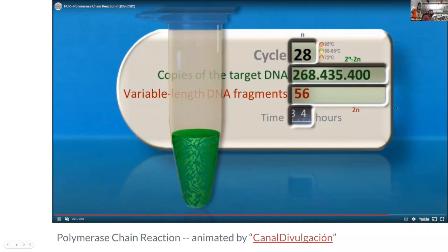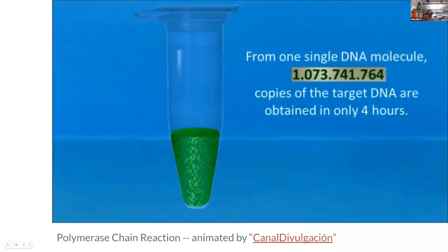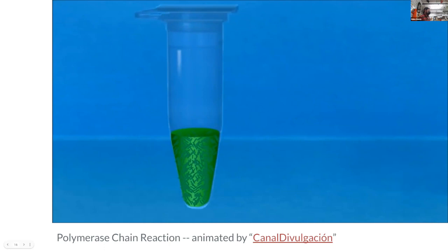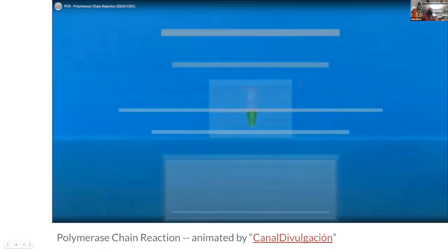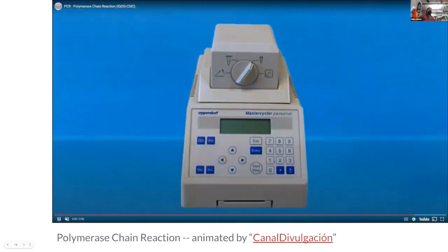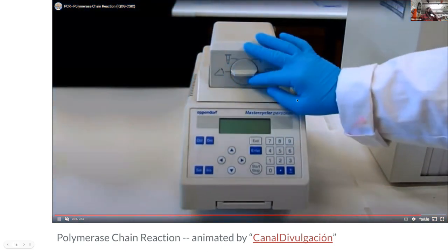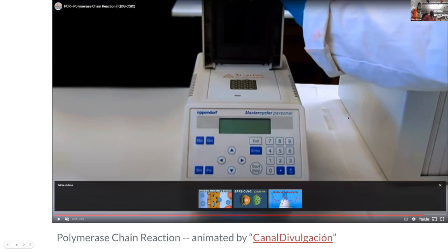So this is a process that we're going to start tonight, but we won't be able to finish tonight. So there'll be another night throughout the week where you'll have to come back in. We'll be able to button up all the details, or we could probably realistically run it when somebody's here and then close up all the details later on. But that is the short version of what's going to happen. So that's the science on this side of what the PCR is going to look like.